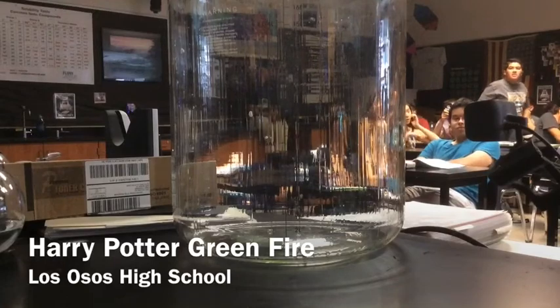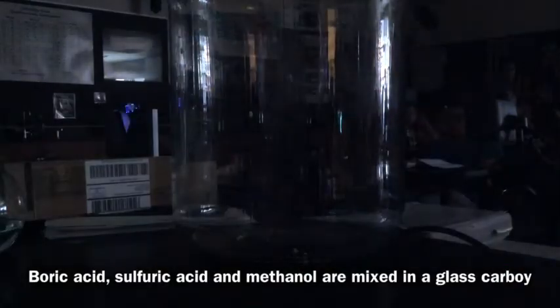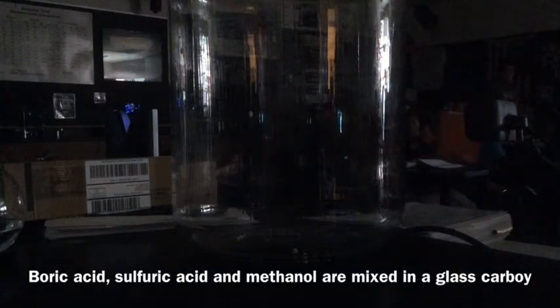Green flash. You guys want to hit the lights for me? So remember, this is going to be really loud, and really green, and really fiery.